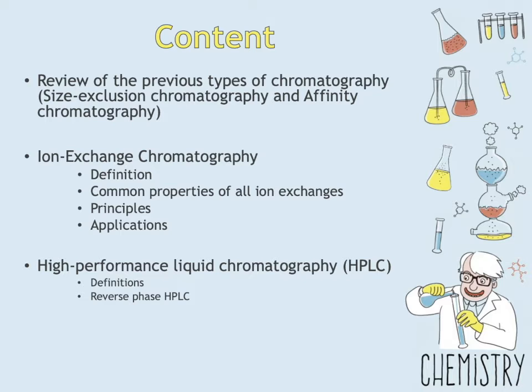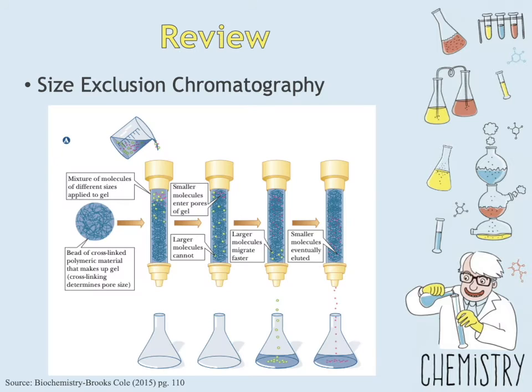Lastly, we will also discuss one of the major topics of this presentation, the high performance liquid chromatography, and go through its definitions and one of its principles, the reverse phase HPLC. Before proceeding to another chromatography, as what I've said earlier, let's review first what we have learned from the previous types of chromatography. First up is the size exclusion chromatography.